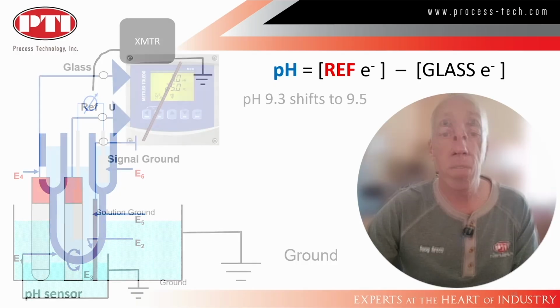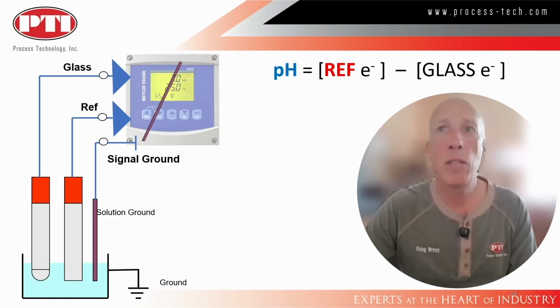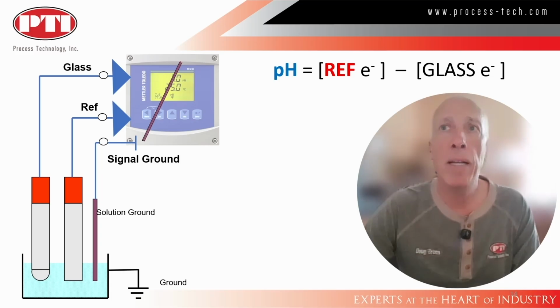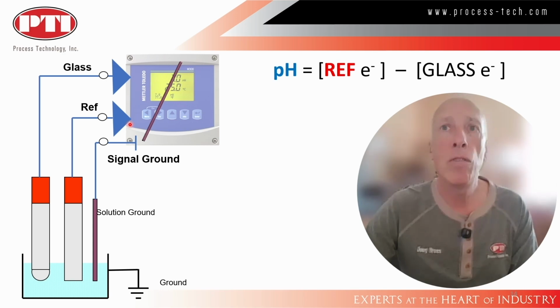This is not correct. Mettler solved this decades ago by incorporating an external platinum electrode that provides a true solution ground. In this schematic, the added ground current would flow through the reference and the solution ground, traveling up through here. However, the circuit is intelligent enough to see that the change is not from the glass electrode and thus isolates the pH value.